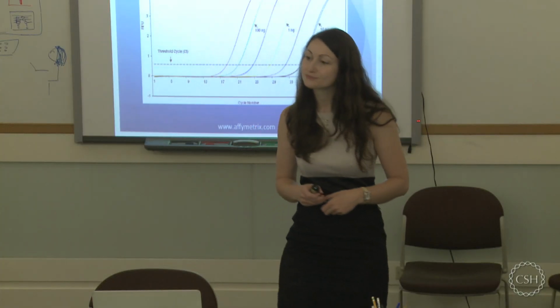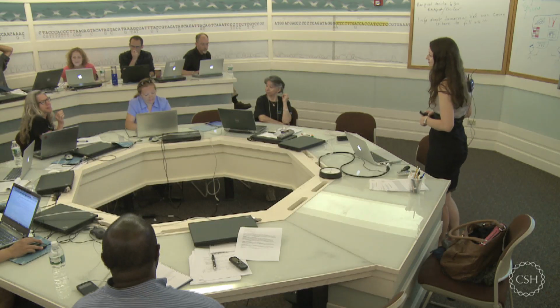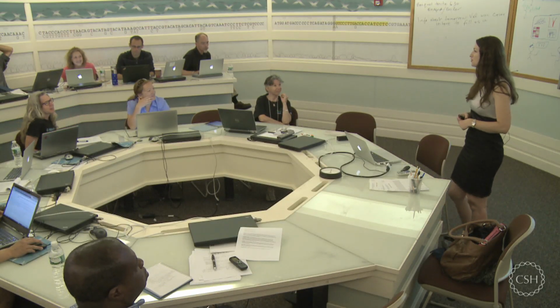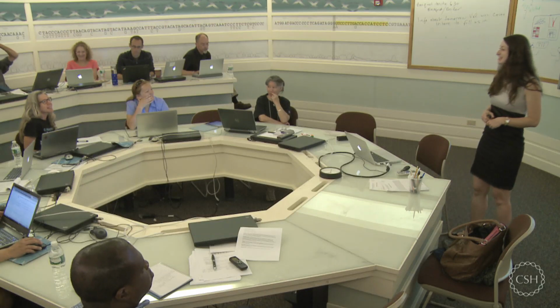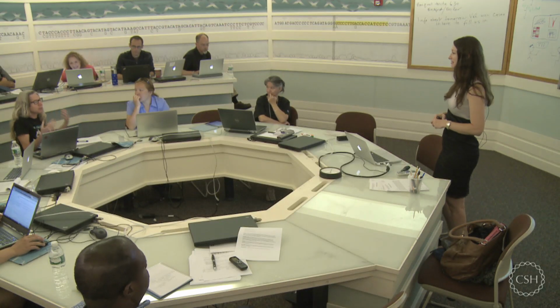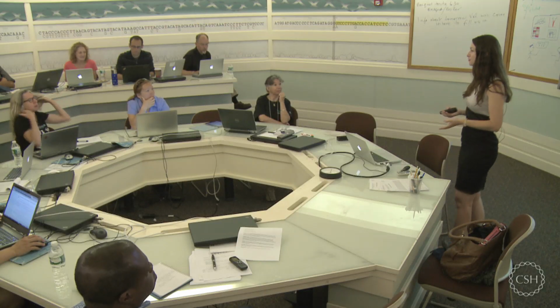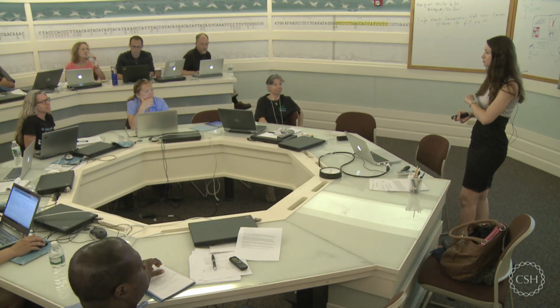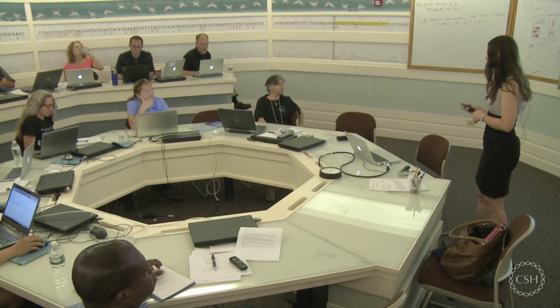So I thought we want the slope to be like minus 3. There's some number, I can't remember what it is. Minus 3.32 or something? Yeah. It is. The ones where our correlation is beautiful and our slope is Yeah. So this has to do with primer efficiency, and I will actually cover that later on. So can I postpone this to later? That'd be great. Okay, fantastic.